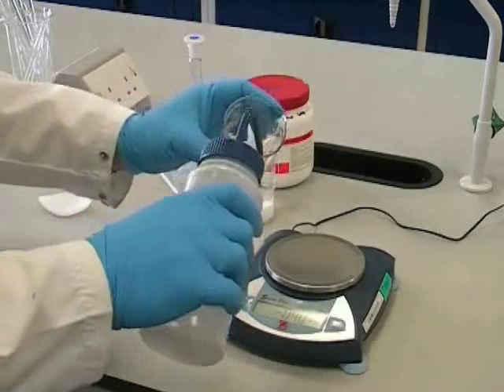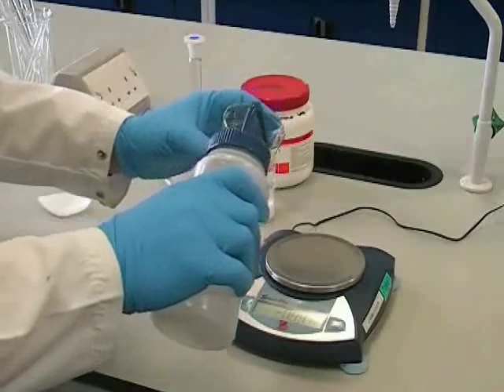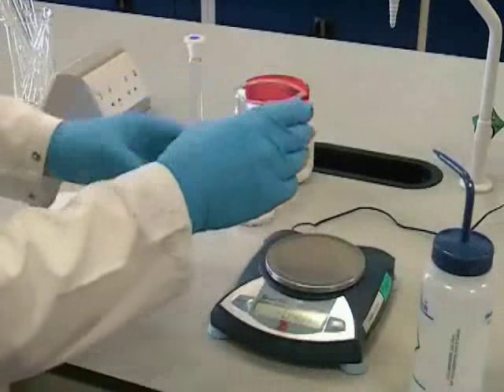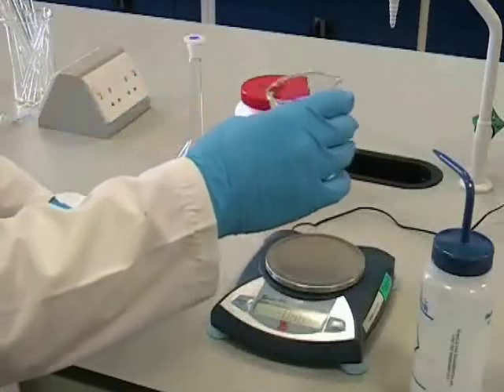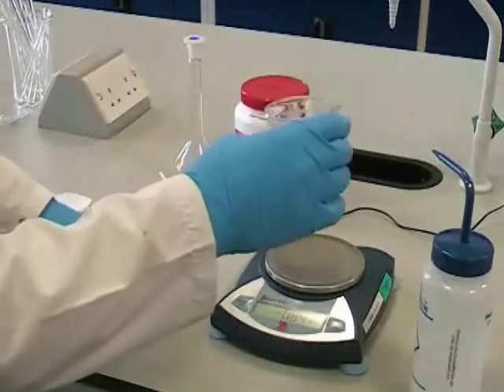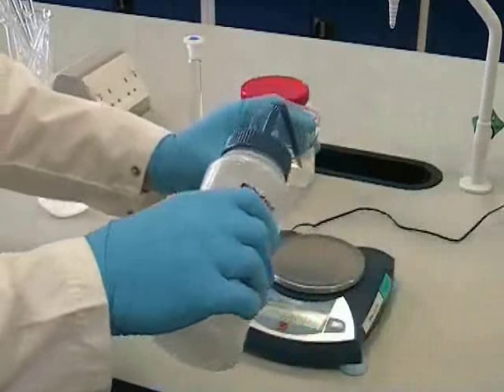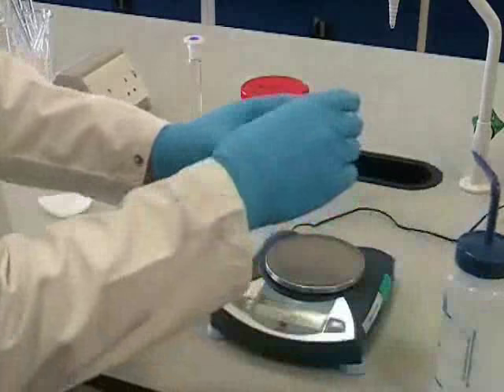You now need to ensure that all of the solute has been dissolved in distilled water, so you should add more water if required, and you should swirl the solution. You may also need to use a glass stirring rod, if you need to.